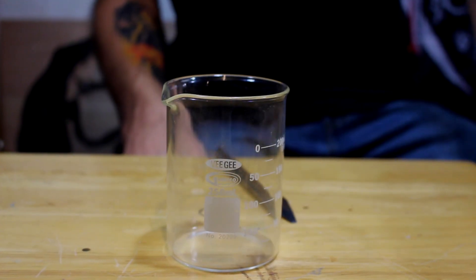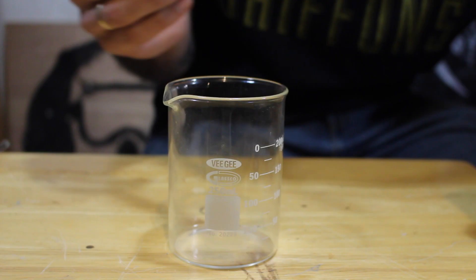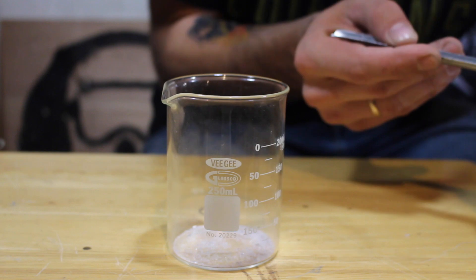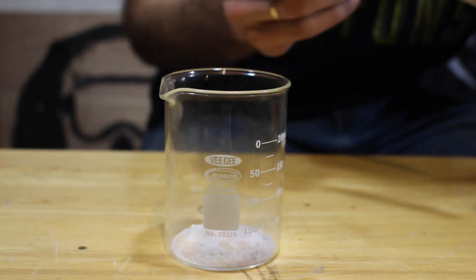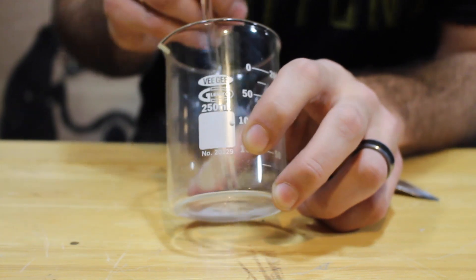Alright, so in order to start a fire this go-around, we're going to use a little bit of silver nitrate and some zinc powder. We'll also use just a little bit of water to get the reaction going. Now, this will dissolve the silver nitrate. Zinc is more reactive than silver, so it will displace the silver and give off quite a bit of energy in the process.